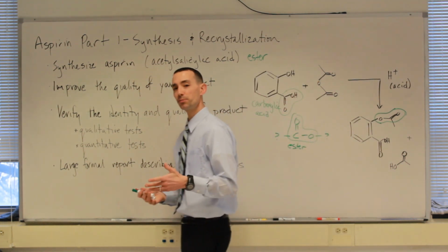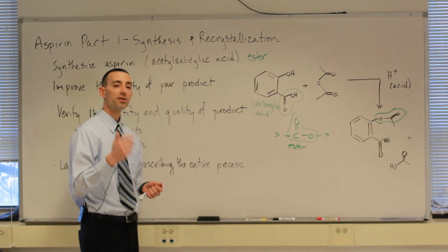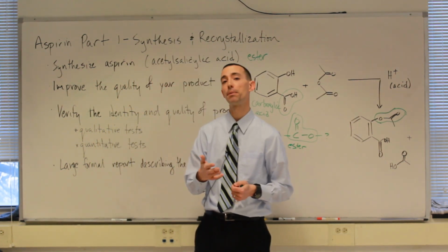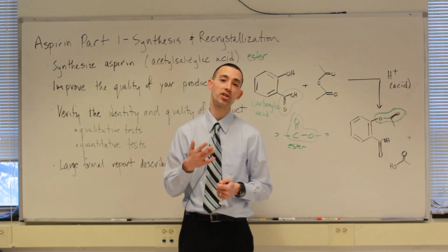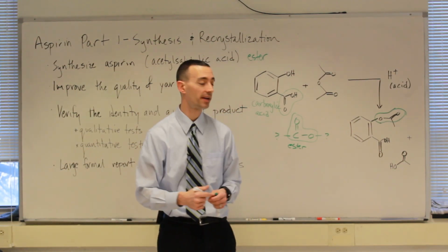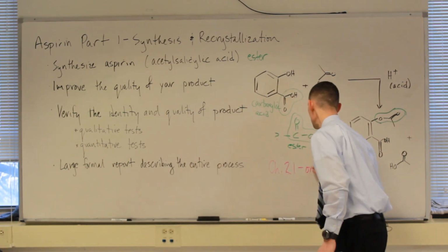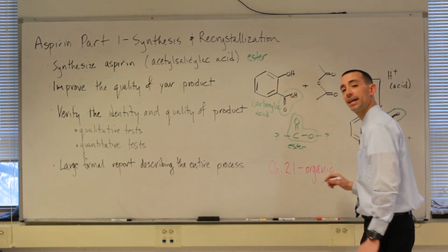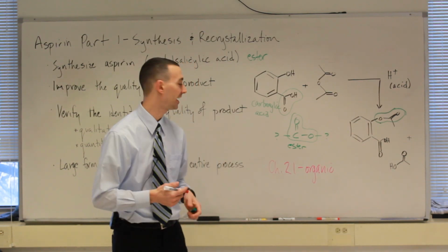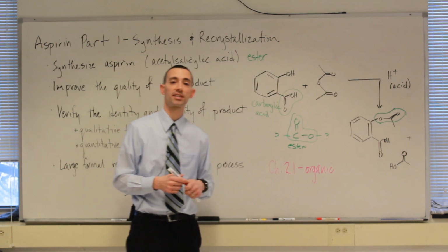Okay? Now aspirin is certainly not the only ester that is commonly found in our world. Your textbook has an entire chapter on organic chemistry. I apologize that there is a typo in the pre-lab instructing you to look in chapter 20. That's now chapter 21 since our textbook has been sort of redesigned recently. So chapter 21 in your textbook has information on organic chemistry and organic compounds, and it describes the entire category of esters. So you'll want to look there to get some information about what are some other materials that are esters.